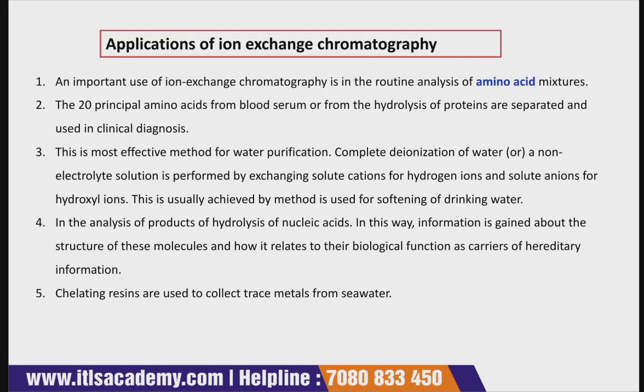Chelating resins are used to collect trace metals from the seawater. So all these are applications of ion exchange, but the most important is the analysis of amino acid mixture. Then it has clinical diagnosis also. Used in clinical diagnosis, they are very effective, and it is one of the most used methods for water purification. So it has a various range of applications in different fields.